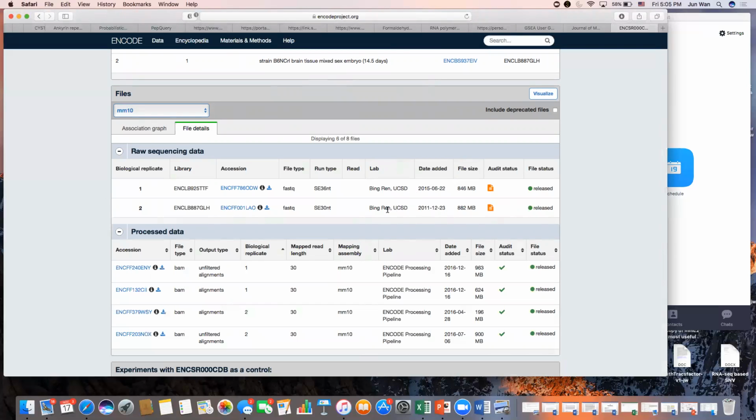Part of your homework assignment is going to be, I would really like to see you do 2 things when you get into MACS2. I would like to see you call peaks for CTCF versus control, and then just CTCF by itself. Okay, because I want you to get a hands-on understanding of the differences that happen when you have a control and when you don't. Control is a very important step in calling these peaks.